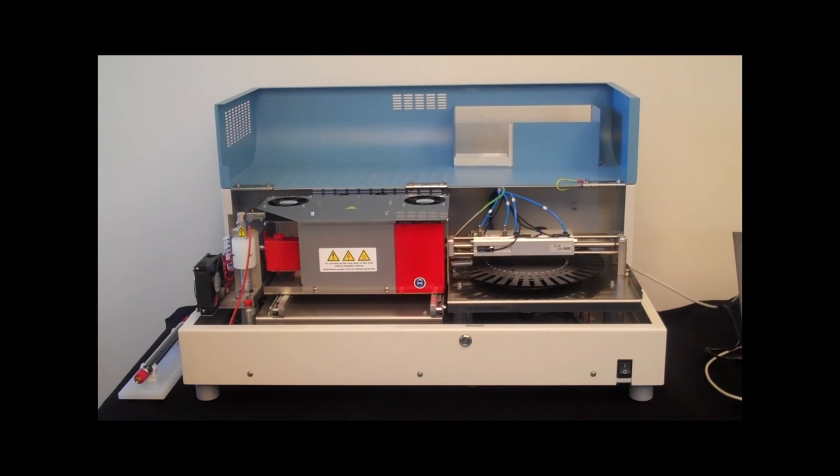A commitment to superior design and ease of use has made the DMA80 the choice for direct analysis in thousands of laboratories throughout the world.